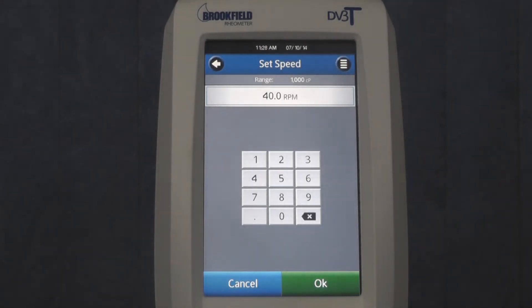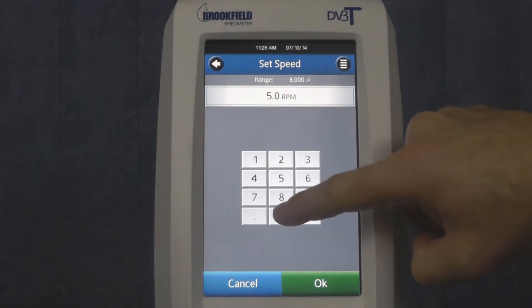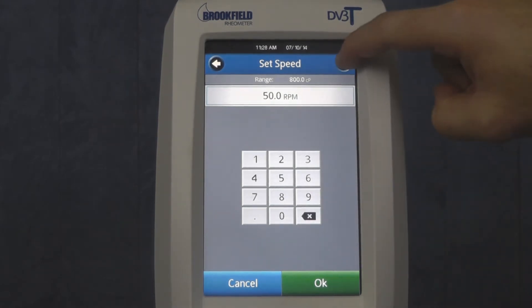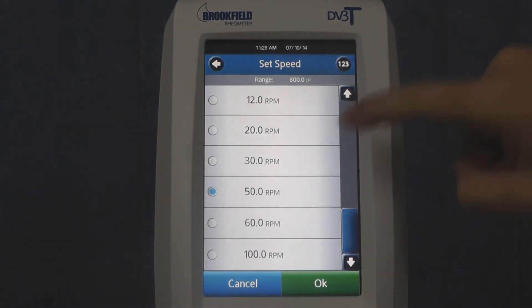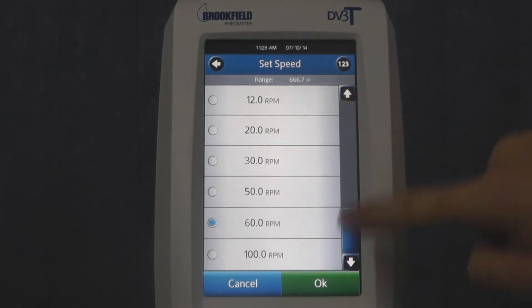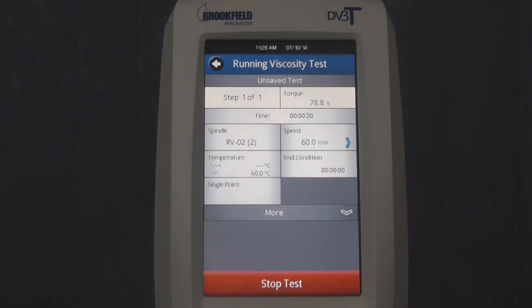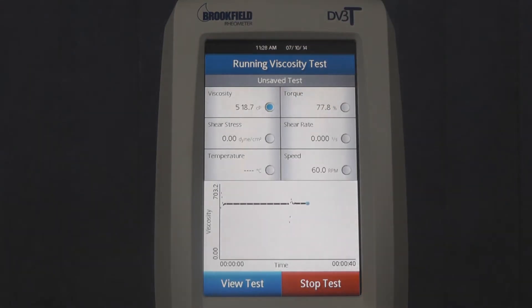You will then have the option of inputting the new desired speed manually, or by pressing the list icon and choosing from a list of pre-selected speed options. Once selected, pressing the OK button will change the rotational speed of the spindle.